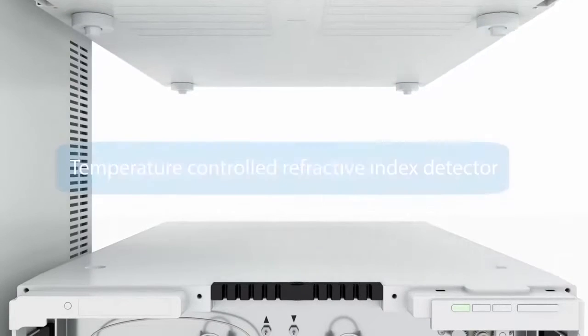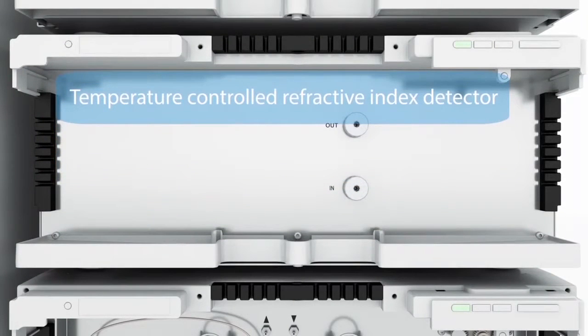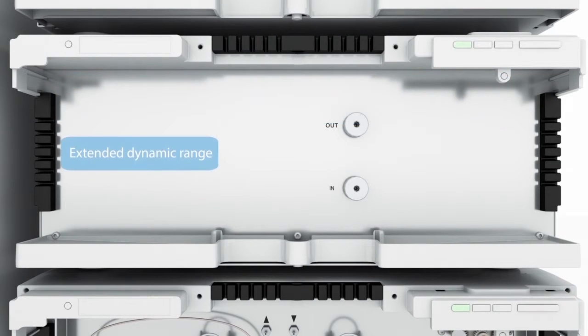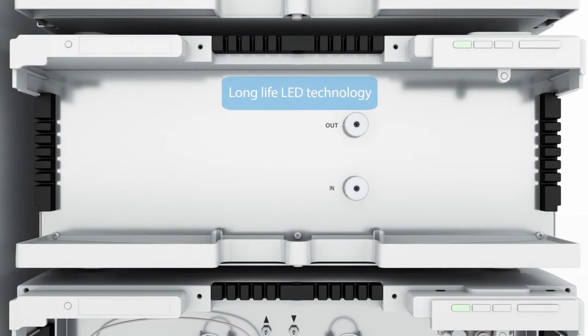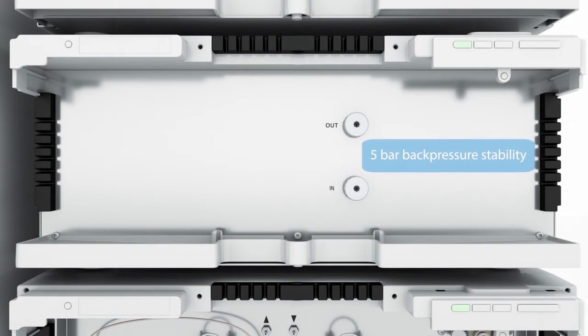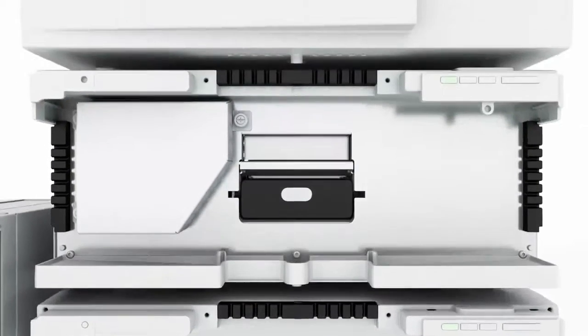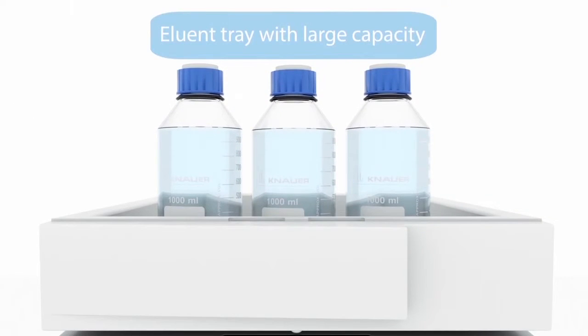The Azura Refractive Index Detector RID 2.1L is ideal for fast and reliable routine analysis of non-UV absorbing substances. It offers a remarkably wide dynamic range. The intelligent temperature control guarantees fast baseline stabilization and stable operation.